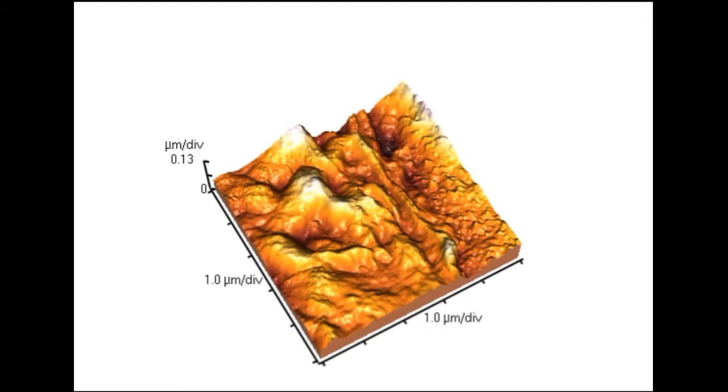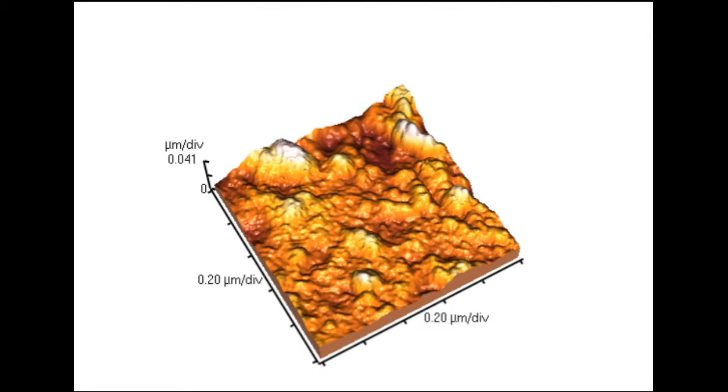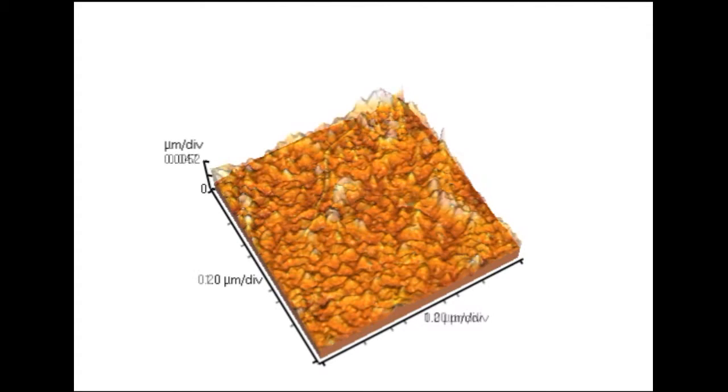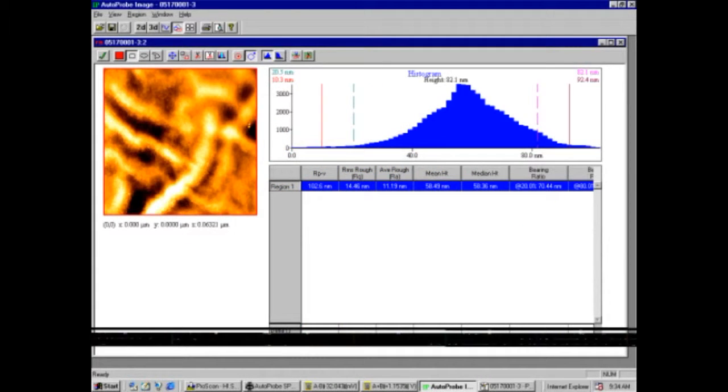It means the image which specially expresses the intensity of a value as a hue. Usually, the correspondence between the intensity of a value and a hue is shown as a color scale in the explanatory notes. The other groups include various matters such as force spectroscopy and potential mapping.